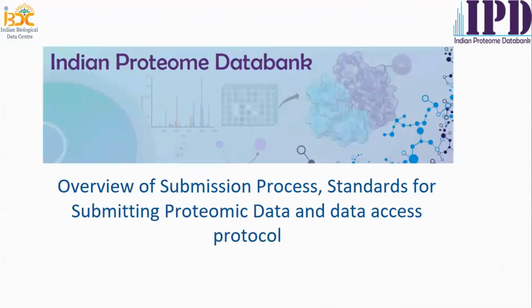In this webinar, the agenda is to give an overview of the submission process in the IPD, then the standards for submitting proteomics data, data access protocols, and a live demonstration of how users can submit their data at the IPD portal.